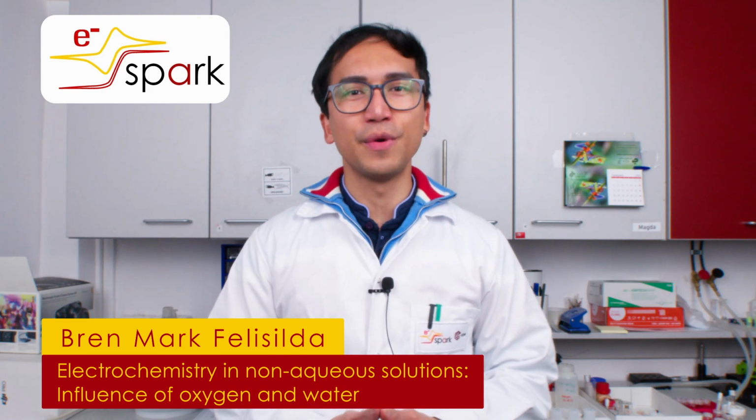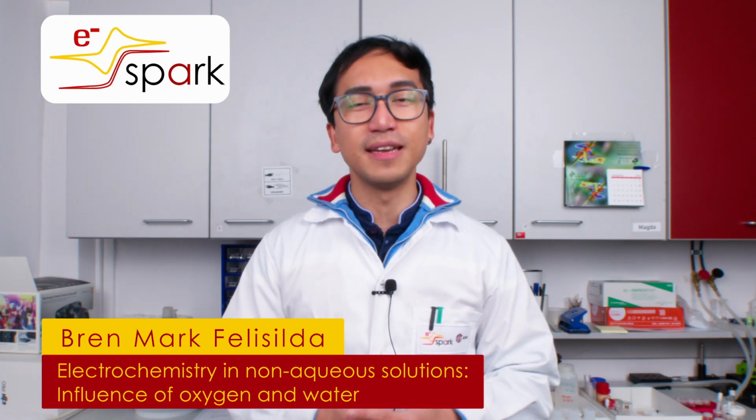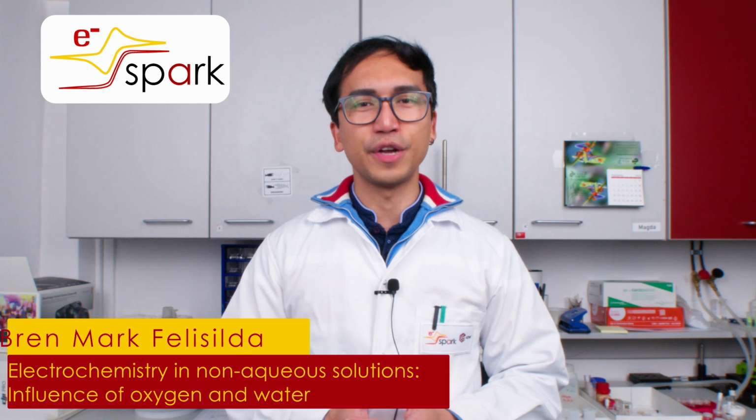Hi, I am Bren, and in this set of videos, I will be showing you the practical aspects of doing voltammetry in non-aqueous solutions. For the first part, we'll be observing the wide potential window that can be accessed using non-aqueous solvents and how it is influenced by the presence of water or oxygen.